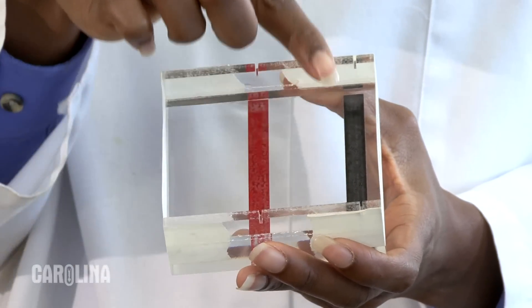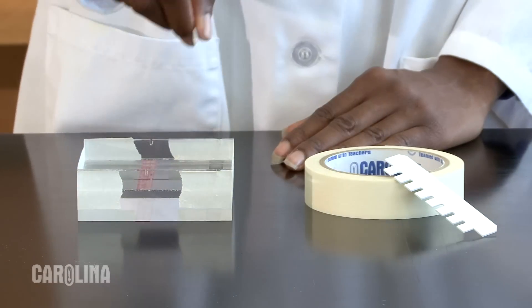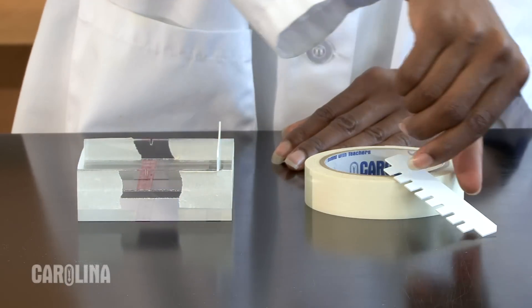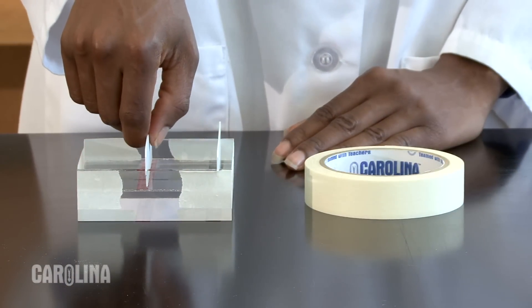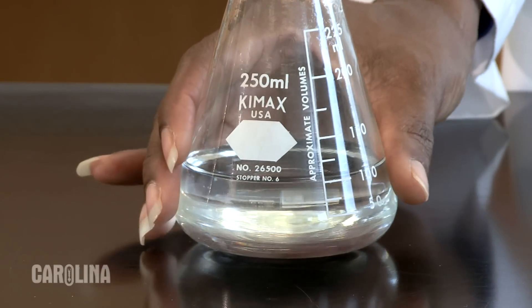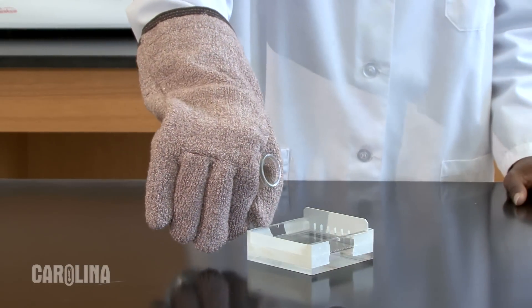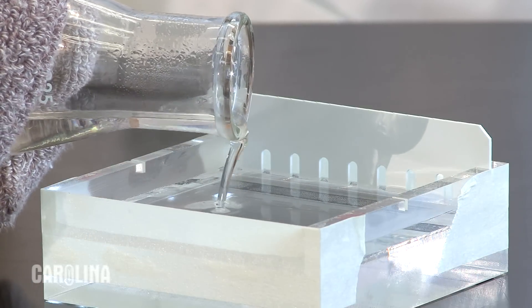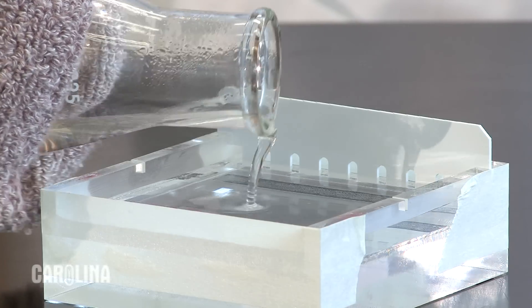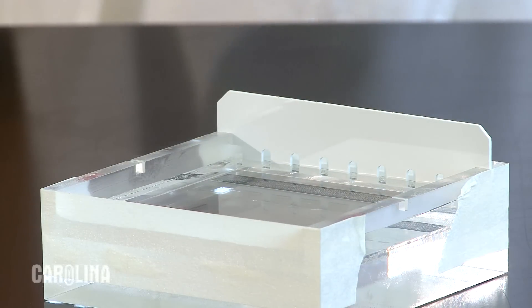Almost all trays have notches for the combs to fit into. Many trays also have notches in the center so that two rows of samples may be run at one time — but only if you can get adequate separation of your DNA bands by running the gel only part way. Once the comb is placed and the agarose is cooled to the point that you can quickly touch it without burning, you are ready to pour. The gel should be between one half and three quarters of a centimeter thick. The gel needs to be thick enough so that the wells are deep enough to hold your sample, but don't make the gel too thick — the thicker the gel, the longer it will take to stain and destain. Make sure that the agarose has flowed completely under the teeth of the comb, otherwise you will have holes in the bottom of your wells.